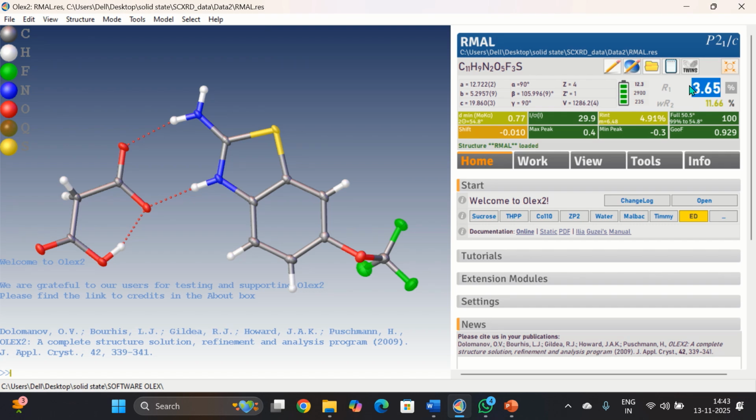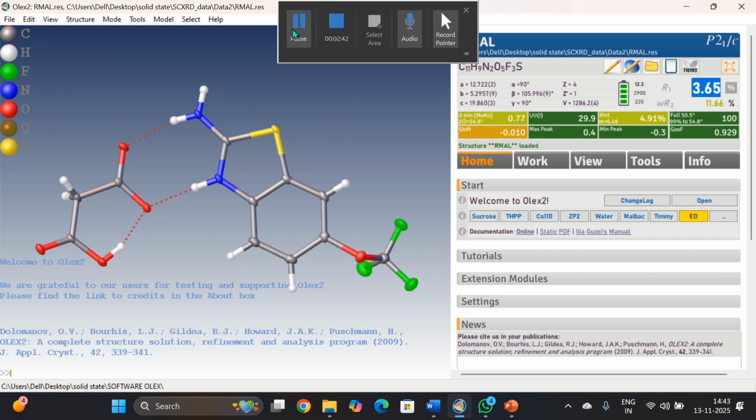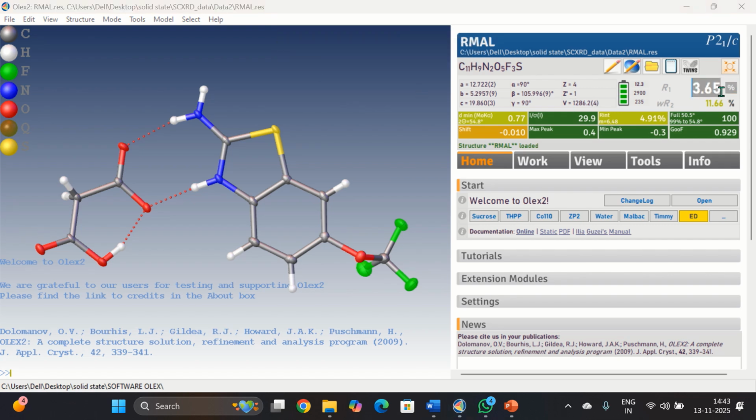For all reflections that we collect, we calculate the F calculated, and that is why the sum is used to calculate the R factor, because for each HKL there is an associated F, and for many thousand reflections that we take, which is uploaded in the HKL and INS file, that is why we use the summation. The smaller the value of this R factor, the better our structure is in agreement with the real structure.